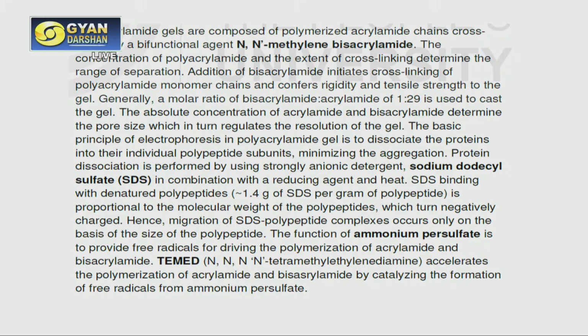So SDS binds to denatured polypeptides, 1.4 gram of SDS per gram of polypeptide, which is proportional to the molecular weight of the polypeptides, which turn negatively charged. So this SDS has a particular stoichiometry in which it can bind to the protein.